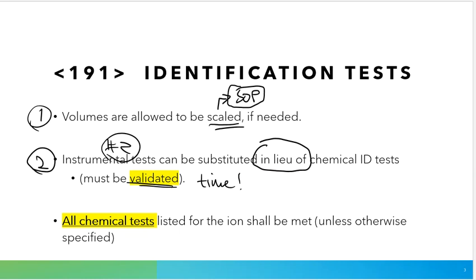So very often, I know it doesn't seem all prim and proper and fancy, but the reagent-based or chemical-based identification tests are much more convenient. They are easier. They are quicker. Within a matter of 1 or 2 minutes, we can add those reagents to my test tube and see what it looks like.